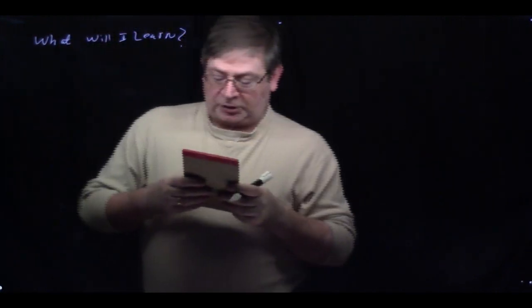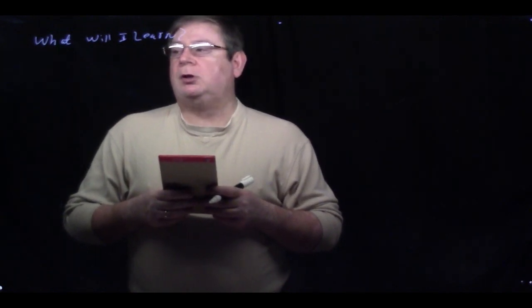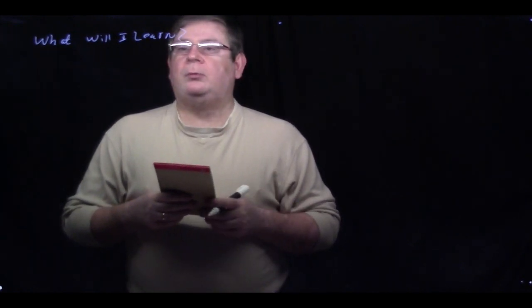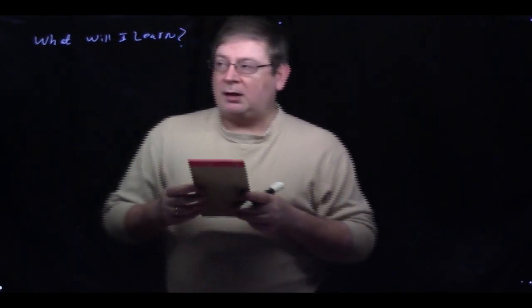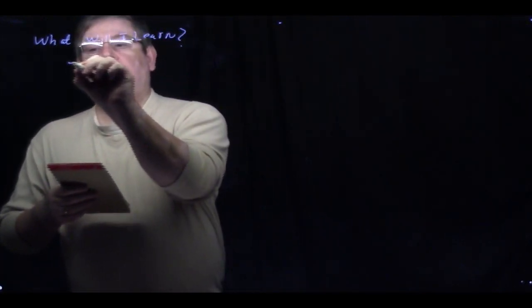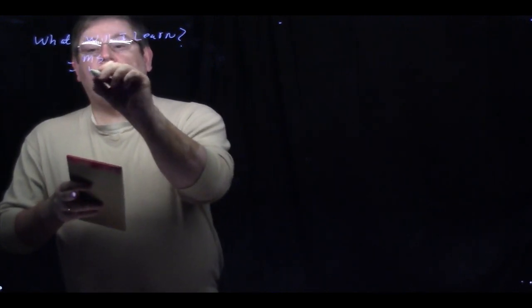So what are you going to learn in this particular course? So what will I learn? Very important question, right? This is not a course that is designed to be a structural elucidation course. So you're not going to learn how to determine structure from an unknown sample. We're going to assume that you have some information about what kind of samples you're looking at. So you're going to learn what we can get from mass spectrometry. You're going to learn which technique to use.